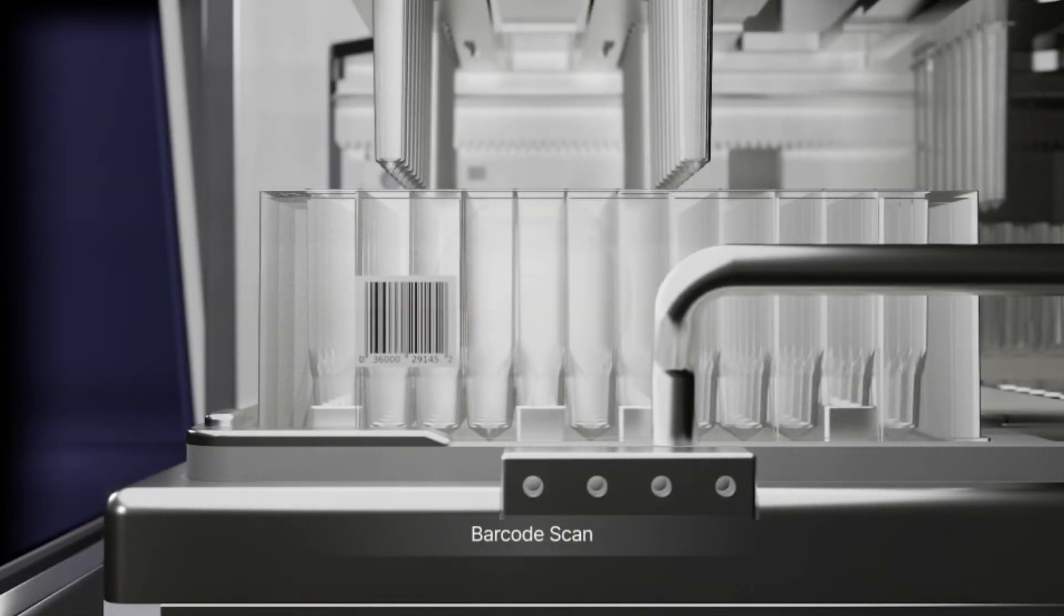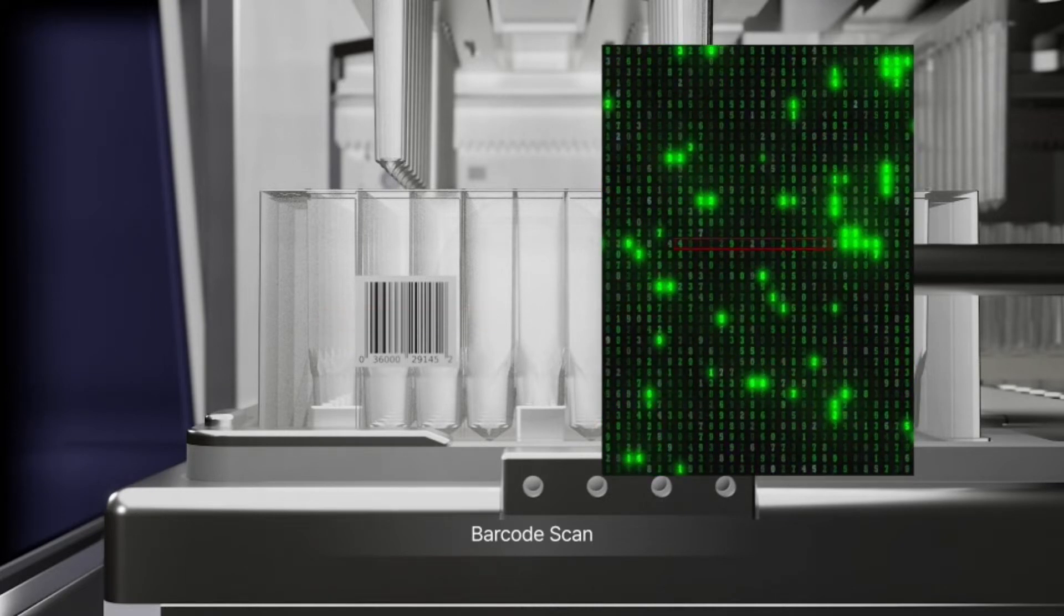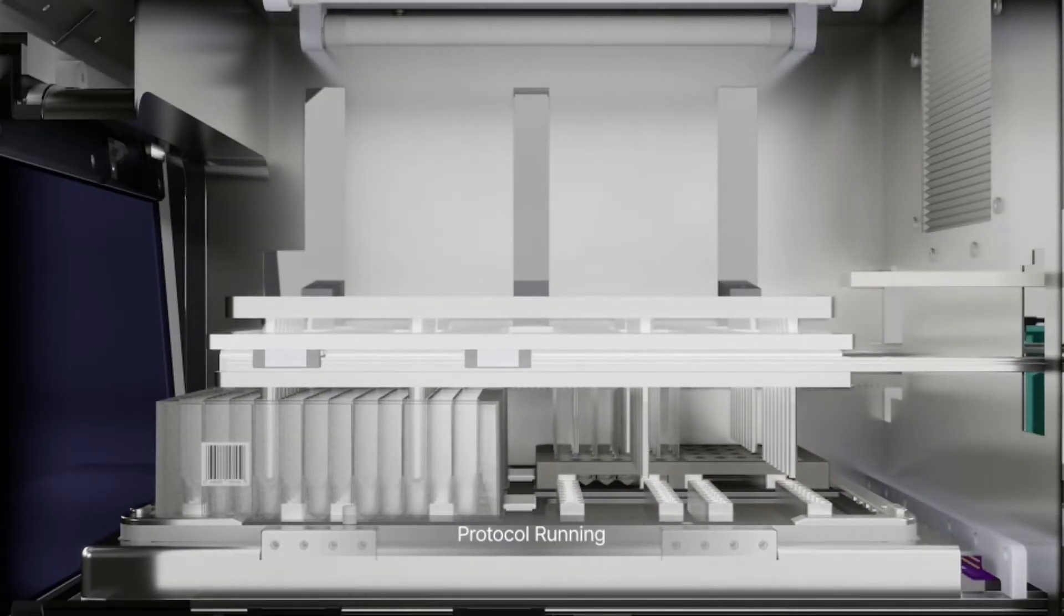New features include on-board barcode scanning, which automatically scans and chooses the desired kit protocol.